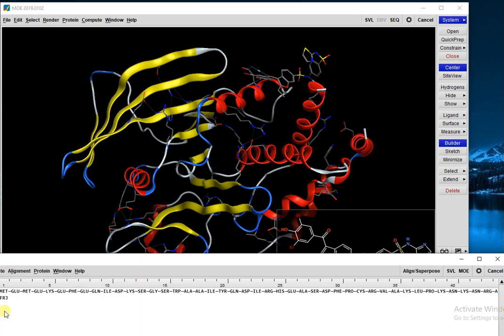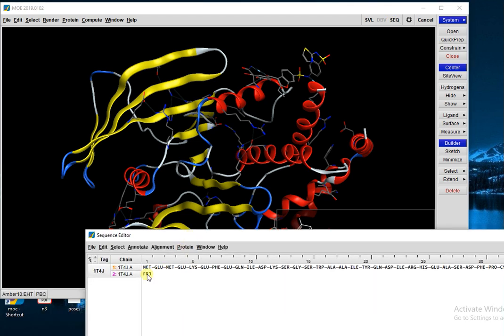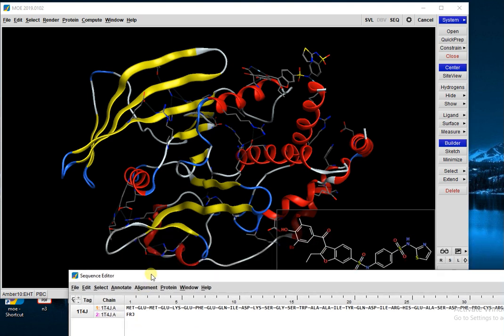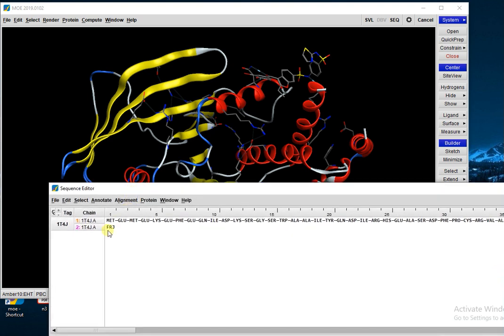Next step is go to Sequence and see if any water molecule is present. In this case, no water molecule is present. If water molecules were present, you would see HOH listed here. Then you would simply right-click on that line and delete that water molecule.